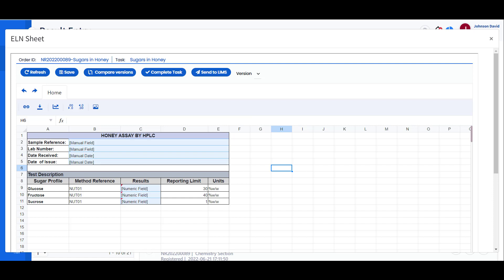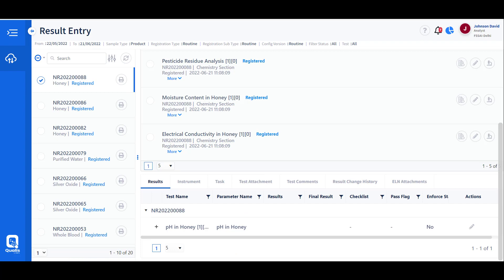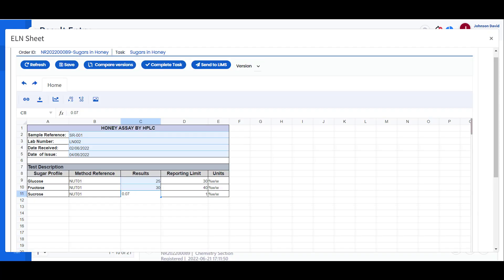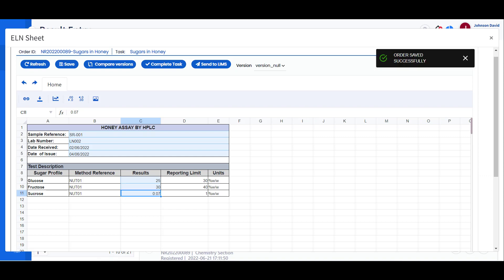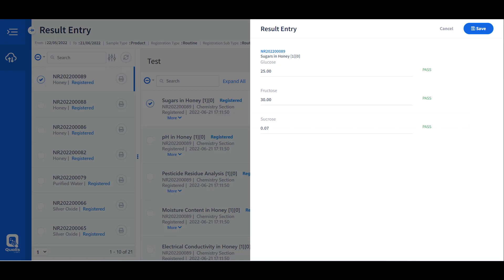The instrument interface pulls results directly from the instrument and saves them in the result entry screen. Once results are captured, the analyst reviews and checks them, and then the results are saved and sent for the next review and approval process. The user can also access the test data sheet to capture results per the defined format. The test data sheet performs predefined calculations when raw data is inserted, and final results are calculated and passed along to the LIMS sample record.